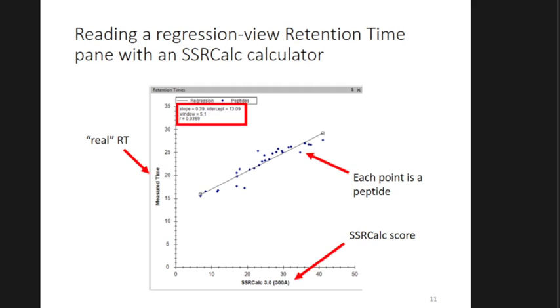That's a setting in Skyline that you can change. And that's maybe a little bit more of an advanced thing. I don't know too many people that mess around with lowering this threshold or raising it, so you don't really have to worry, besides knowing that if, for some very special experimental reason, you needed to change it, you could.